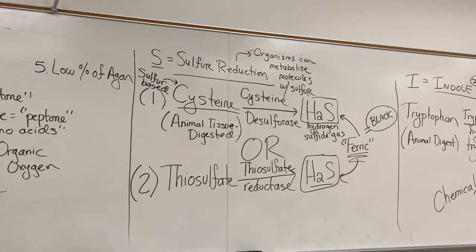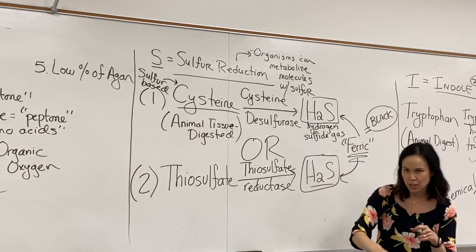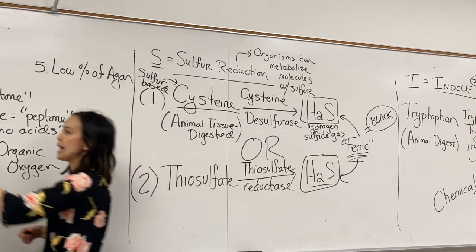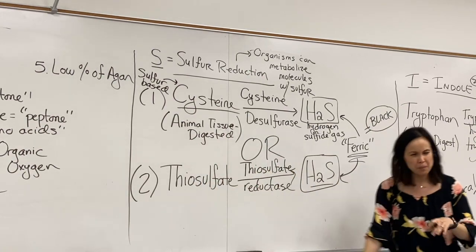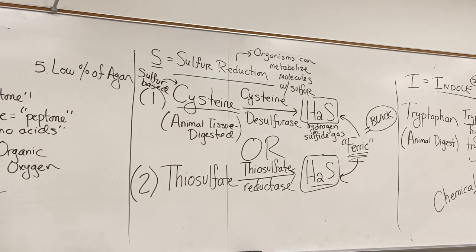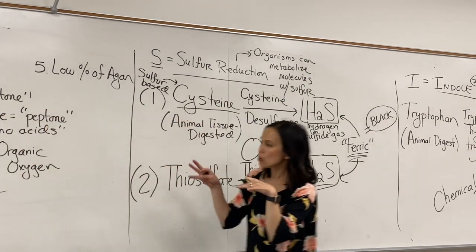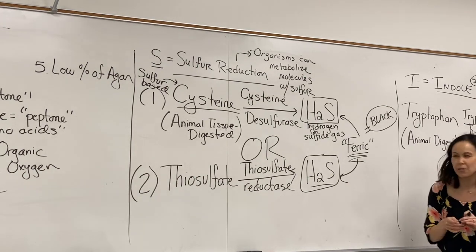You guys, the tall, remember we said it looks like you should boil it, but we didn't. So we did like the single stab. And technically there's a low percentage of agar in here too, just to give your organisms a little wiggle room, if that makes sense. And then usually if they're motile, they'll kind of jet out a little bit. So along the stab line, it'll kind of puff out and have like a Christmas tree effect, if that makes sense.